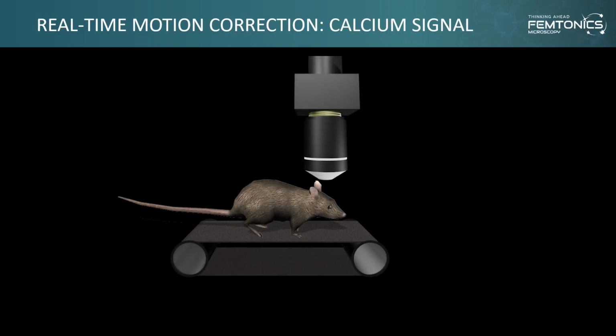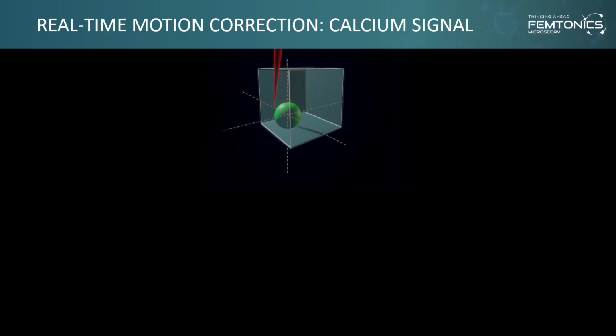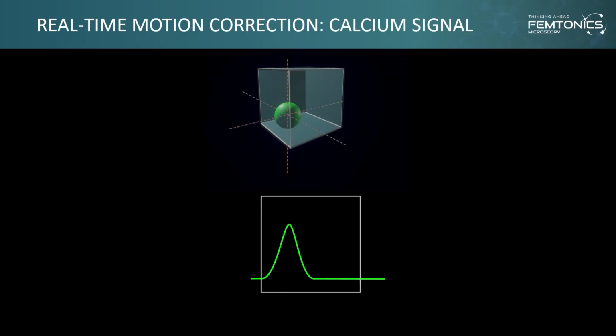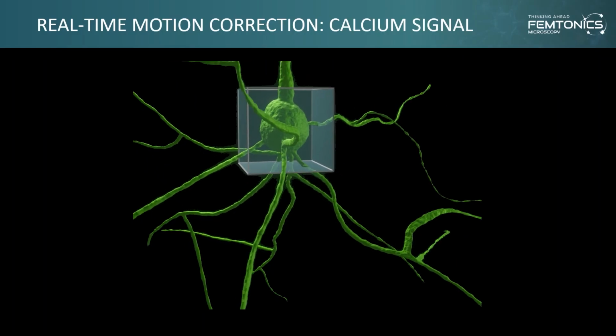When the animal moves vividly, it is worth having a larger fraction, but generally 10% is a good choice. Then at the FPGA level, the firmware calculates the dislocation vectors between the centers of the intensity profiles of subsequent reference drifts in each direction, X, Y, and Z. Based on this estimation, the movement will be compensated on the next imaging drifts by shifting the target of the focal point.